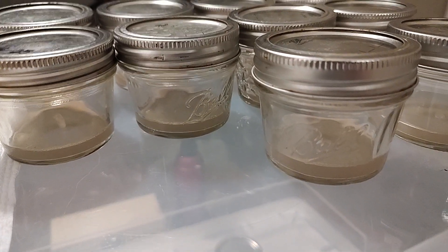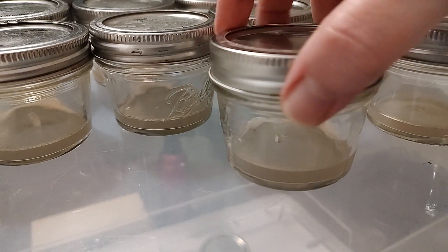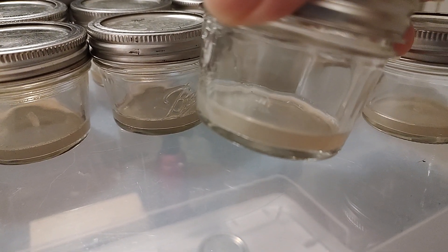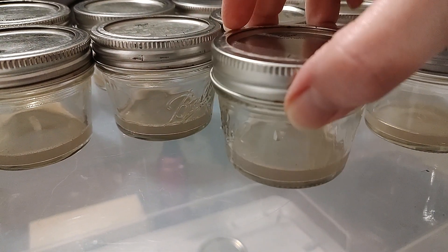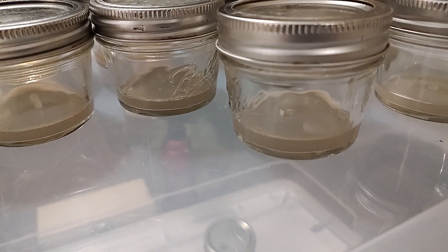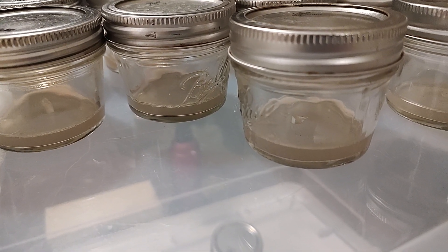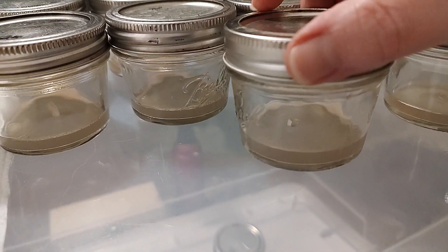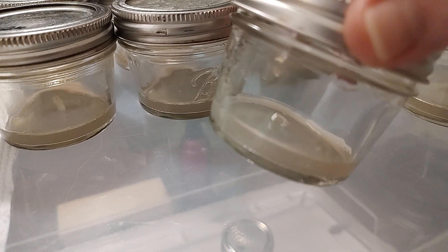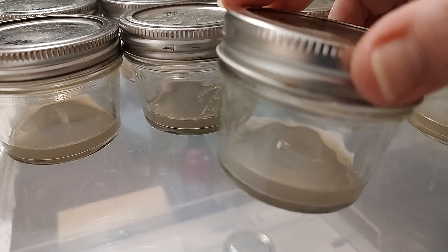Welcome back to Mycology Exploration, where we are simply sharing what works for us — home mycology made easy. We have received so many questions about agar, transfers, and cloning, so I am creating short topical videos answering your questions. Many of you requested real-time videos, so it's me, the camera, and whatever we're working on. I apologize for any shaking or audio issues — I'm really just focused on delivering the information while showing you in real time.